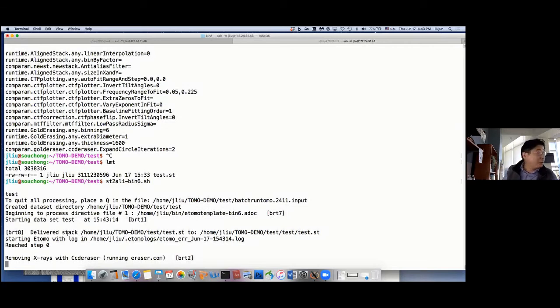It's not necessarily perfect in some cases, but the majority of the time it seems pretty robust. And then you save a lot of time. By combining manually aligned data, just like I did, plus this automation, it gives you a chance to generate a reconstruction, hopefully within 1 or 2 days.